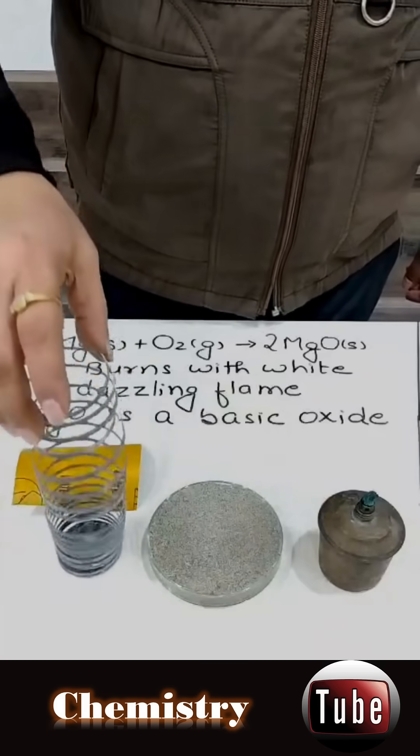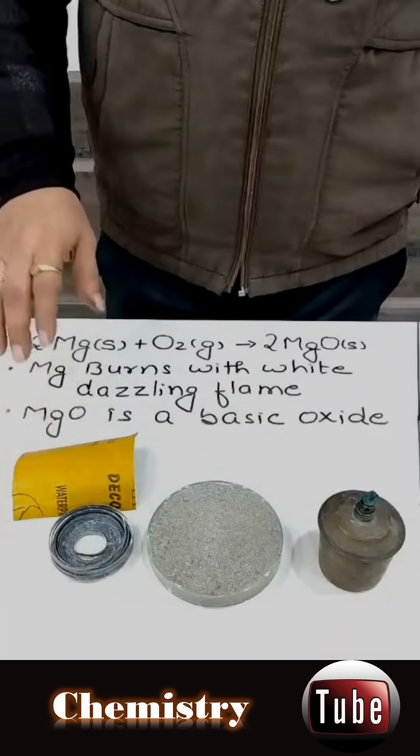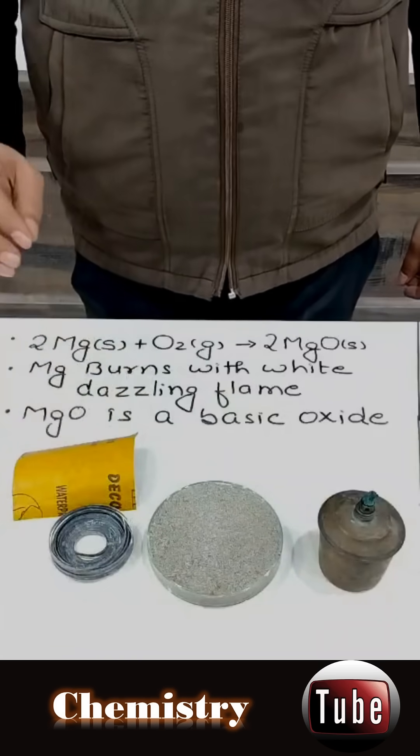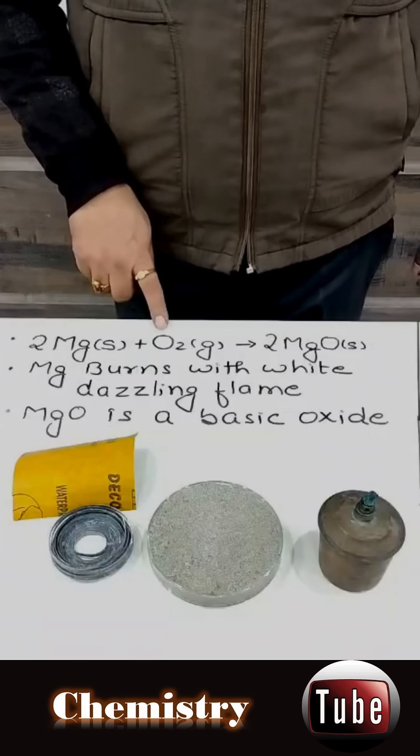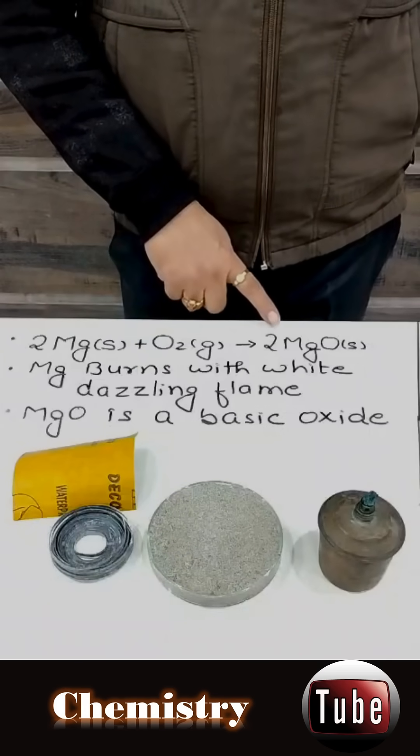This is magnesium ribbon. It is a metal. We will try to burn this metal and when magnesium metal burns in presence of air or oxygen, it will produce magnesium oxide.